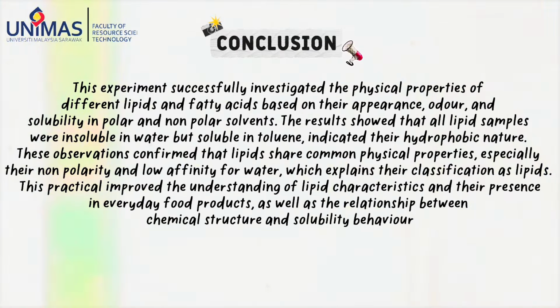In conclusion, this experiment successfully investigated the physical properties of different lipids and fatty acids based on their appearance, odor, and solubility in polar and non-polar solvent. The results show that all lipid samples were insoluble in water but soluble in toluene, which indicated their hydrophobic nature. This observation confirmed that lipids share common physical properties, especially their non-polarity and low affinity for water, which explains their classifications as lipids. This practical improved the understanding of lipid characteristics and their presence in everyday food products, as well as the relationship between chemical structure and solubility behavior.